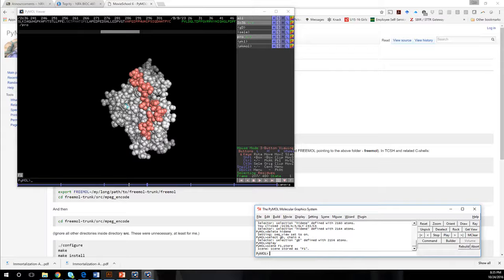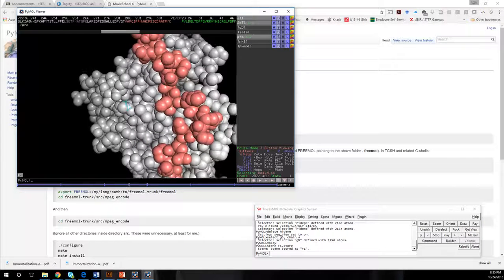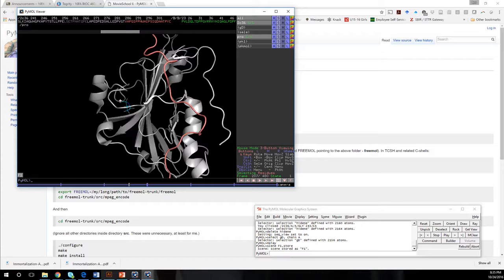And so this is where I'm going to use my right mouse button, and I'm going to zoom in here. Okay, and I'm going to change a few things because with spheres it's a little different. You notice that the 4 options up here, line, stick, ribbon, and cartoon, are going to be different than non-bonded dot spheres. So I'm going to get rid of the spheres for a second. So let's do it on GD. I'm going to hide the spheres, and then I'm going to show as a cartoon, and you can still see that it's highlighted in this salmon color.